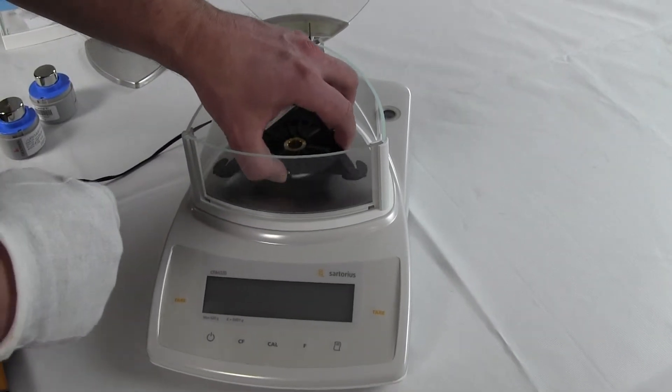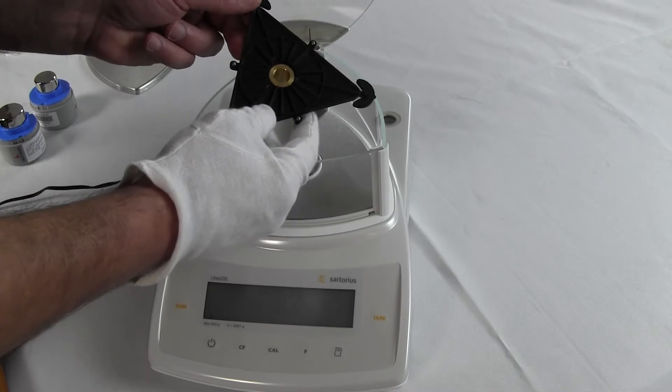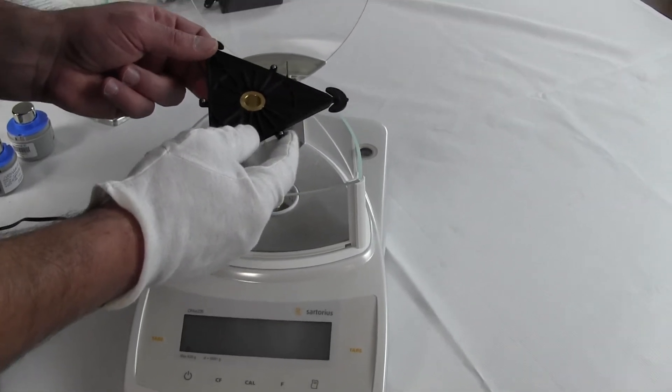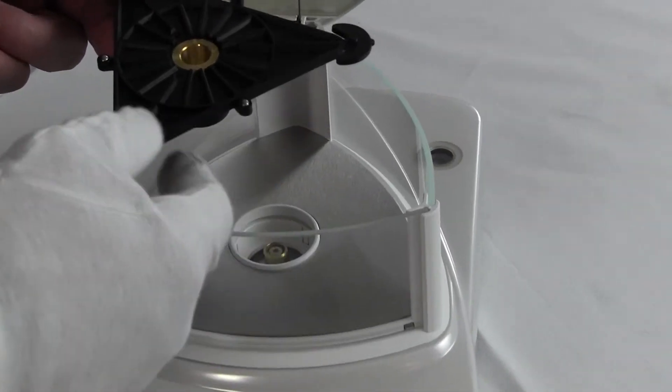Sartorius is one of the few manufacturers out there with this triangular weighing platform. It gives you more surface area. And then this here is our pan support. You can see Sartorius makes a great balance. Very simple design. There's not tons of parts here. Very easy to assemble.